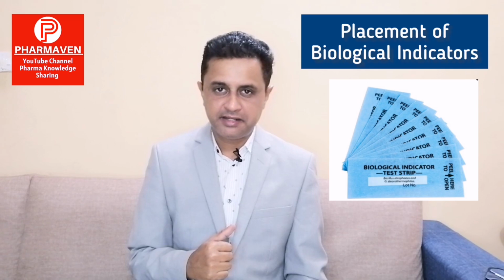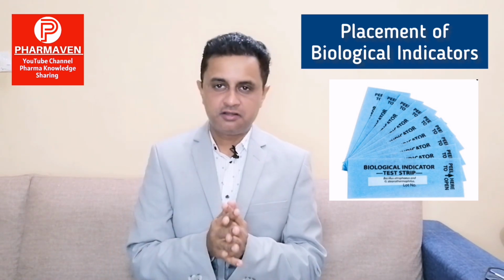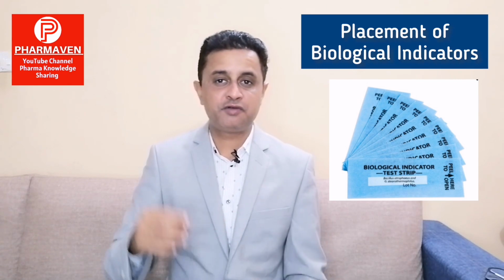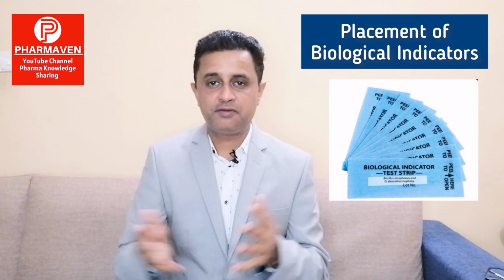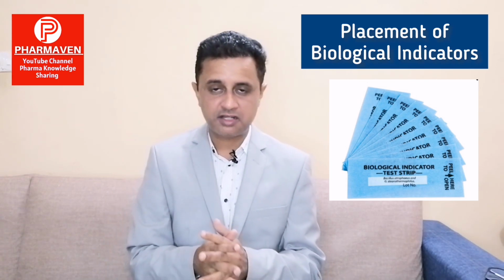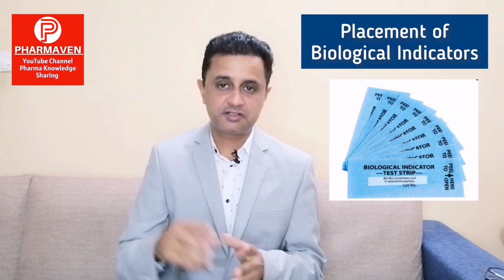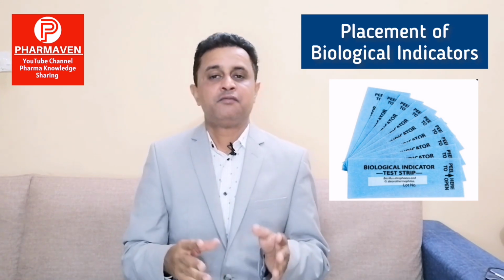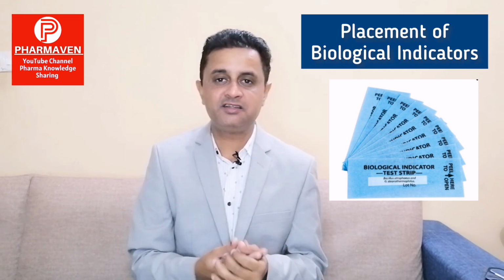Third important factor is placement of biological indicator. We may have a properly placed load and proper parameters, but if our BIs are not placed properly, if it is not clearly defined how to place BIs. For example, we want to put the BIs in the worst case locations, but if the placement itself is restricting the steam penetration.